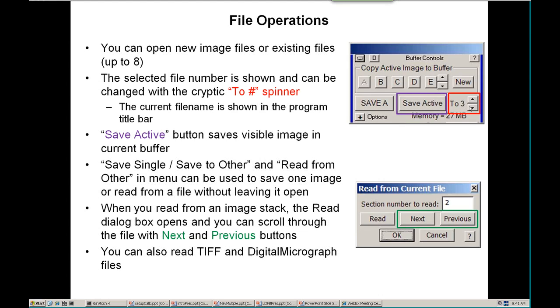Usually if you use hotkeys or whatever to save your images, it's going to save the image in Buffer A, and there's a button for that. But if you want to save the image you're looking at — whatever buffer you're looking at, say Buffer C — you can use Save Active and it will save that. Once you have a file open and images have been saved into it, these are MRC image files with a fixed format in terms of data type and size. Once you've saved one image, you can only save other images of the same size, and you'll see buttons gray out and come back as you take different kinds of images.